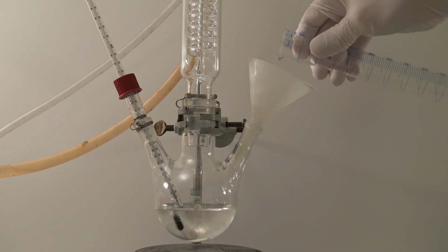Then it was stirred. The water should remove water-soluble compounds like potassium acetate, methanol and acetaldehyde, while also causing the layers to separate. When the stirring was stopped, a mixture collected at the bottom, which was mostly cinnamaldehyde and benzaldehyde. Then another 30 ml of distilled water were added and the mixture was stirred again.